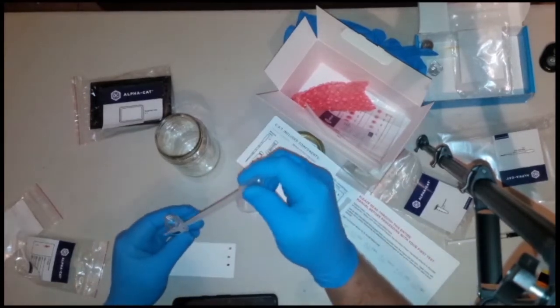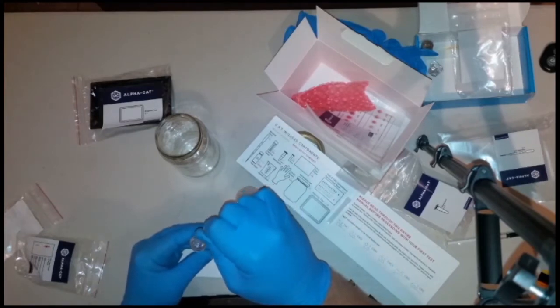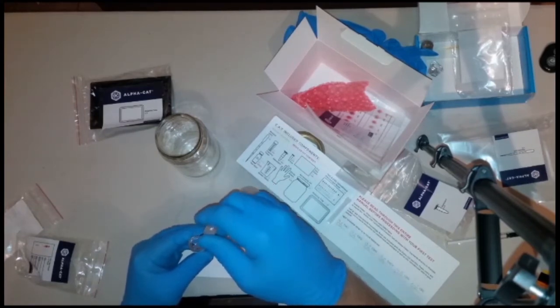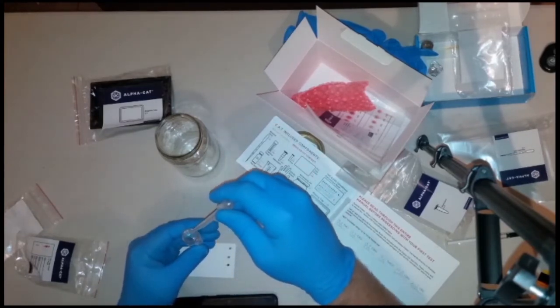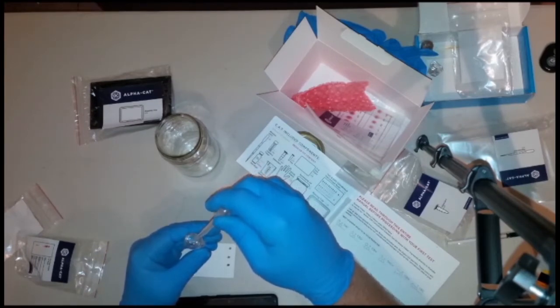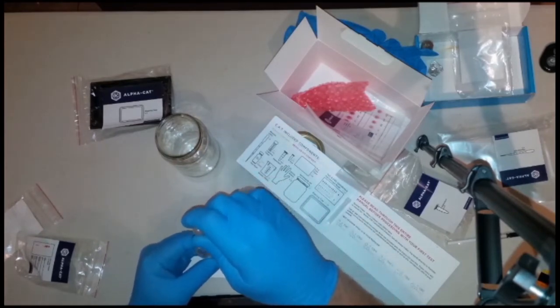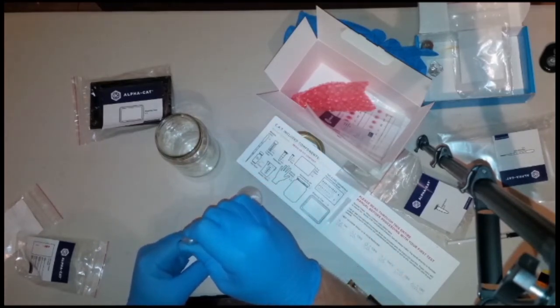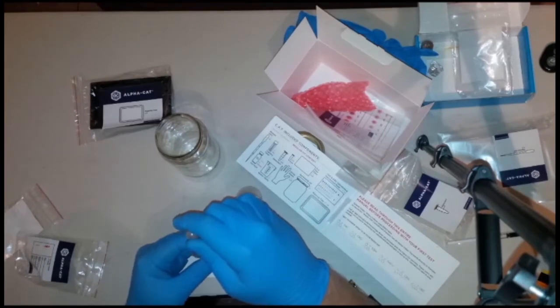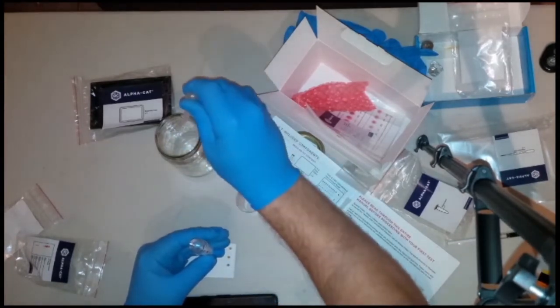Now the test plates have the sample solution on them, see the three red dots. We need to take 2 milliliters of the test fluid using the pipette and release it into the supplied glass beaker. Then carefully lower the test plate into the beaker with the marked test spots at the bottom. It will lean at a slight angle, this is fine. Once this is done, close the lid and leave the test plate to soak up the whole solution. You will see it slowly travel to the top. This will take 25 minutes.